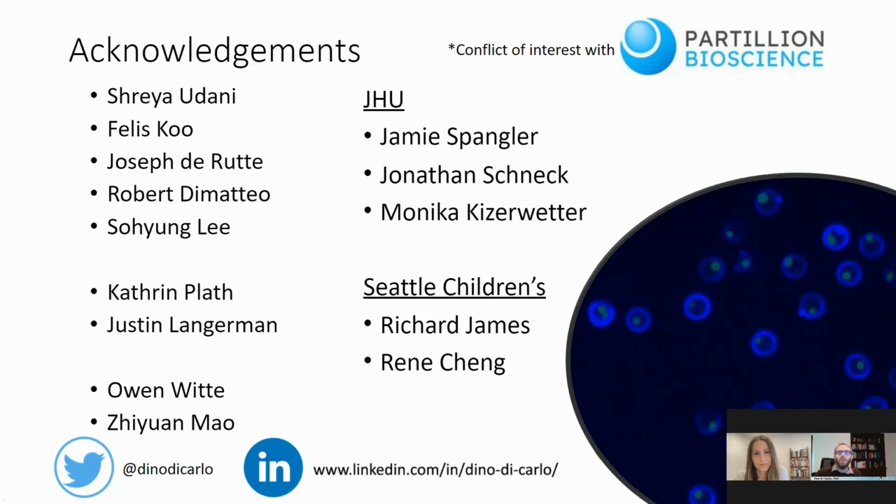Yeah, so in the work I showed today, we were growing mesenchymal stem cells up to 24 hours in the nanovials. Remember, these are not fully encapsulated, so there's still media exchange that can go into and out of the nanovial to allow the cells to get nutrients, allow waste to be removed. It's kind of like a little test tube or petri dish for a single cell. So we've grown between 3 hours up to 24 hours. If you start to go to longer time periods, then the cells start to divide and grow out of the nanovials. So we're usually limited to about 24 hours maximum.